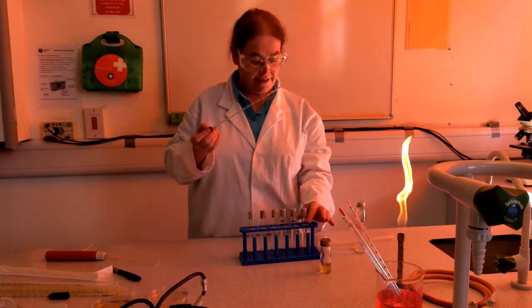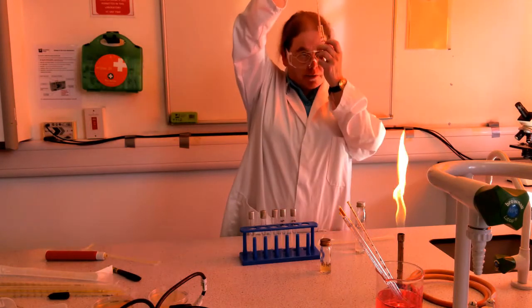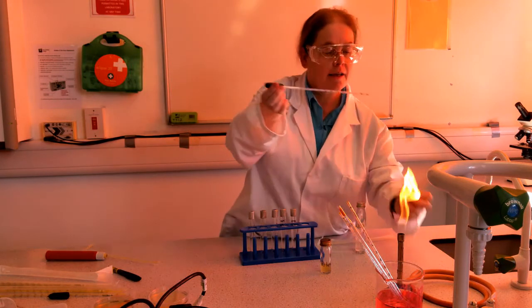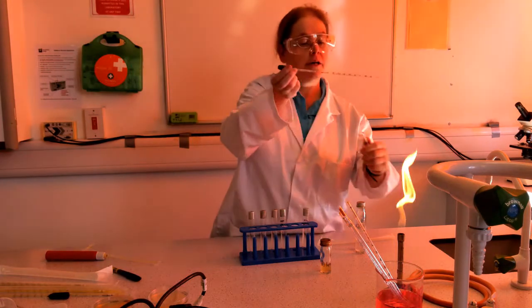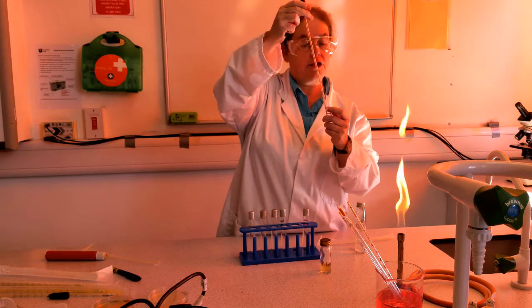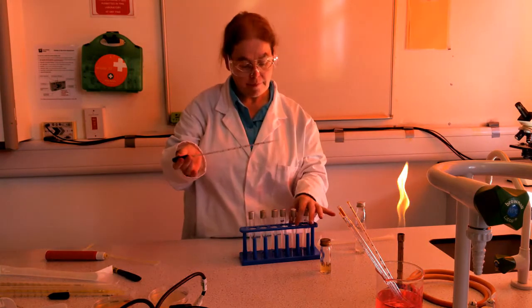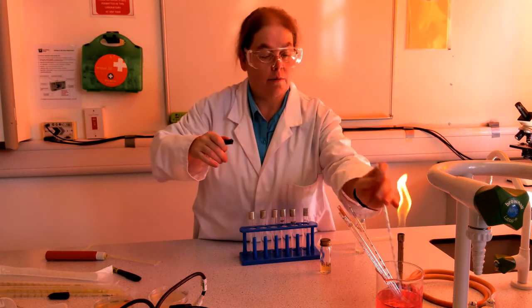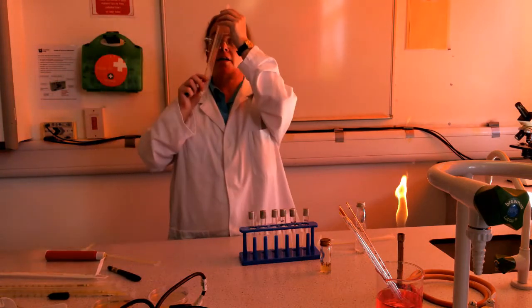Okay, so again, correct sterile technique, 0.1 from this tube into this tube. So in this tube, I've diluted my original bacterial culture 10,000 times. And I'll repeat that, obviously with a clean pipette, which I'll get the right way up.